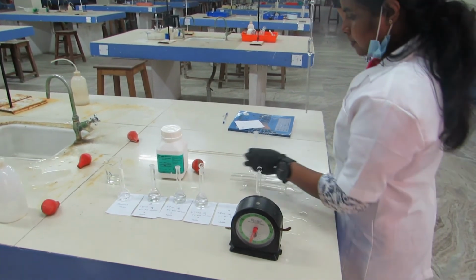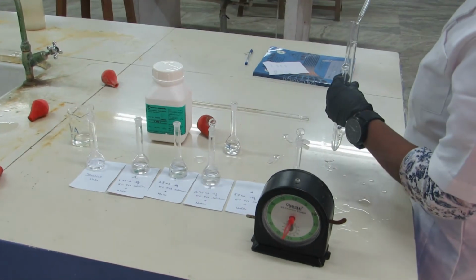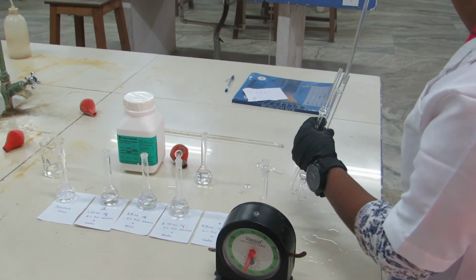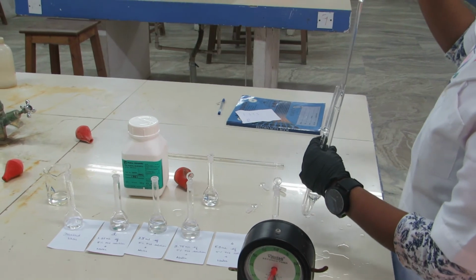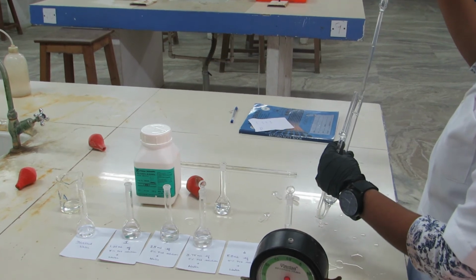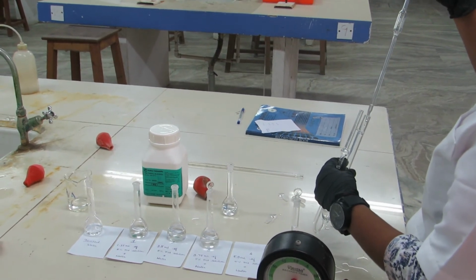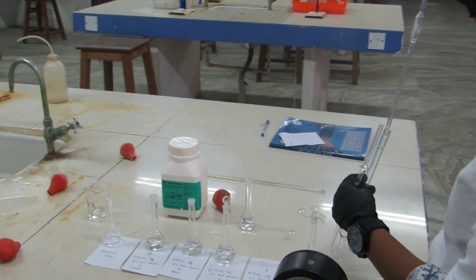Again, now one more concentration, that is the 1% solution, we are doing. See that? We have done four concentrations up to now, five concentrations. The first one is 0% or zero concentration. There is no PVA in the first. That is solvent only, that is water. We are using water as the solvent in this PVA water system. Okay, PVA is a solute and water is a solvent.